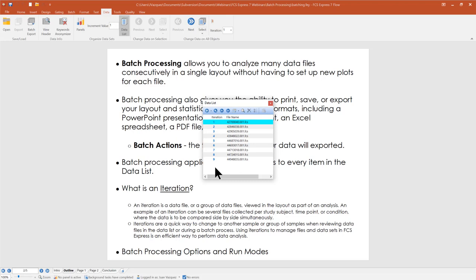An iteration could be several files grouped together based on a study subject, or as part of a time point study. More commonly, it might be a titration experiment where a number of files are grouped together, each representing varying concentrations of antibody collected as part of that experiment. In essence, the iteration in FCS Express could be whatever you want — a single file or multiple files — and the layout shows a single iteration at a time.